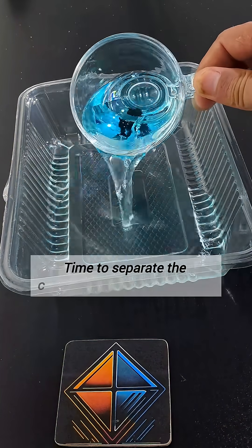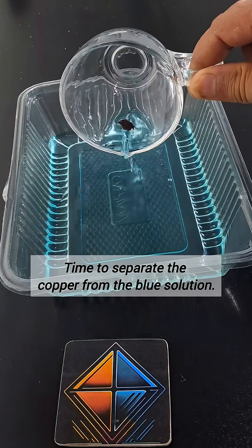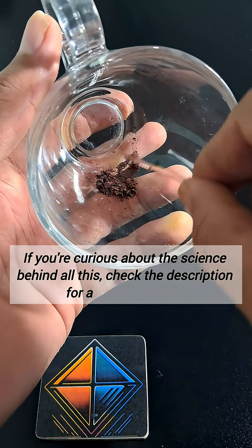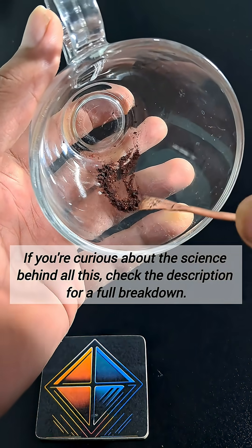Time to separate the copper from the blue solution. After drying, we get this copper powder, made from electricity. If you're curious about the science behind all this, check the description for a full breakdown.